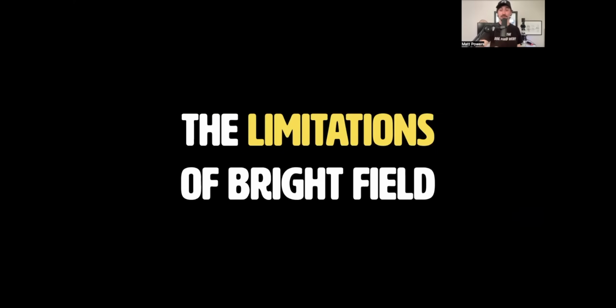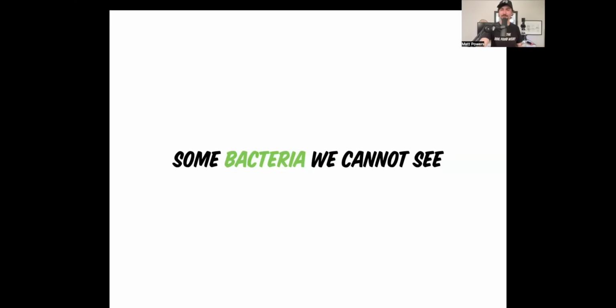The limitations of bright field. So this is the reality. Not only does epifluorescence have these advantages, there are these unspoken limitations of bright field that people don't know about. And then I bring them to the fore, and people are like, what are you talking about? So I'm just going to be open about it and have people check it out because it's easily verifiable. This is all just stuff that should be known, isn't known.